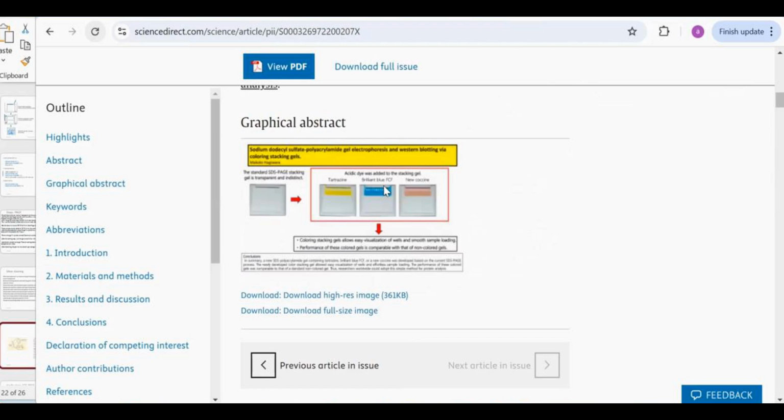So we have talked about separating gels. These are the stacking gels, right? Which are going to have a different composition as compared to the resolving gel. Then when we are talking about the electrophoretic process, we have to take into consideration the buffer, the glycine component is there, and buffer reservoirs are going to be in two forms as zwitterions, right? So net charge, say for example you take glycinate anion, it is going to be negatively charged. So the role of glycinate, the role of chlorides, we have also talked about in the previous lecture.